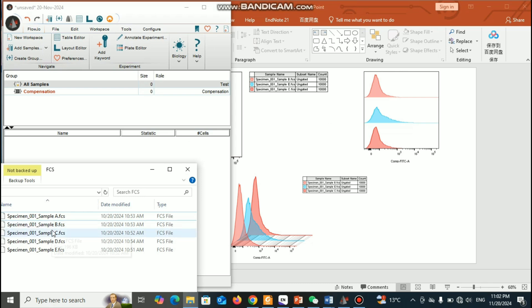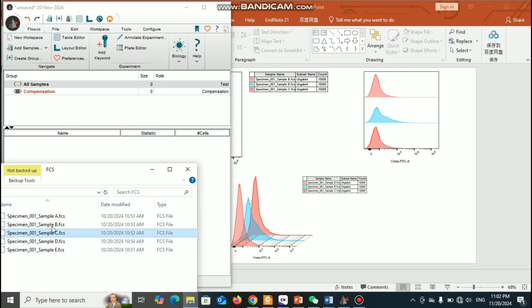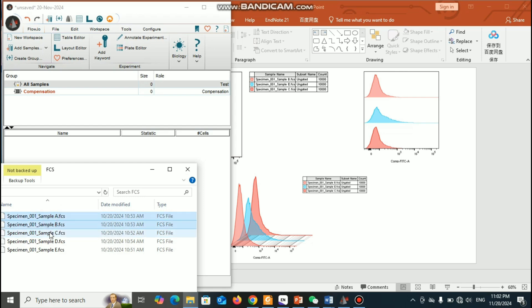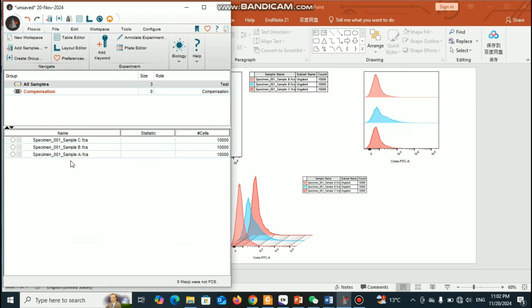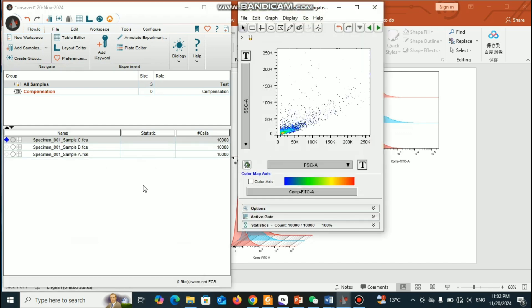Let's begin. I have some data and I will take around three data sets. First I need to drag this data to the FlowJo window. Now you can double-click and we will get this kind of pop-up window.